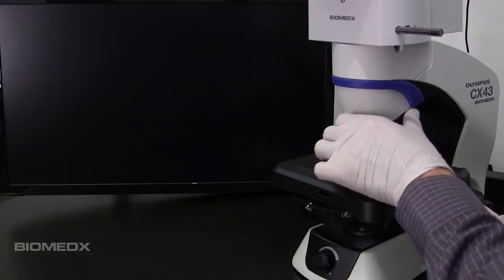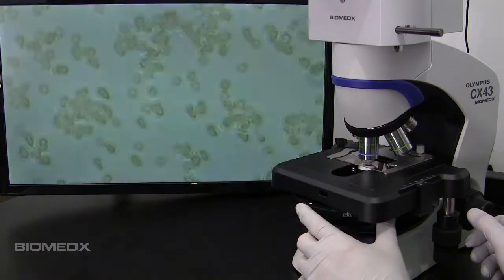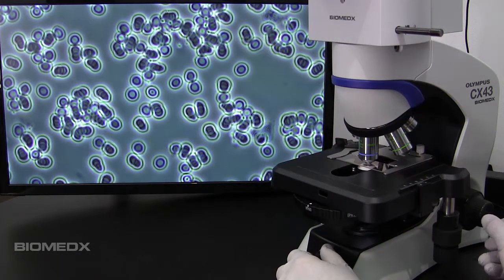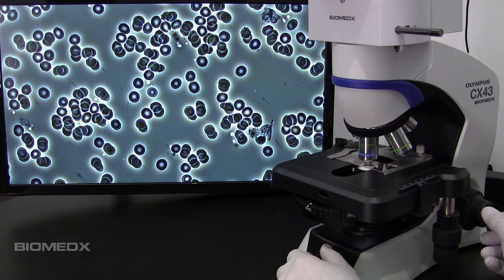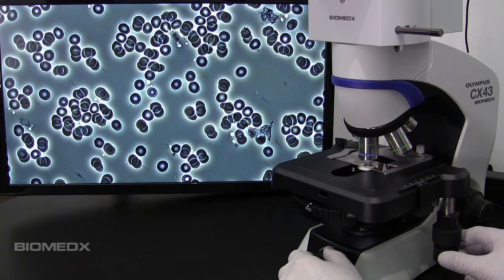Right now I am flipping from a 20x objective to a 40x objective which will double the magnification. This right here is phase contrast. It is beautiful. There is no microscope out there that delivers a better phase contrast image than this.